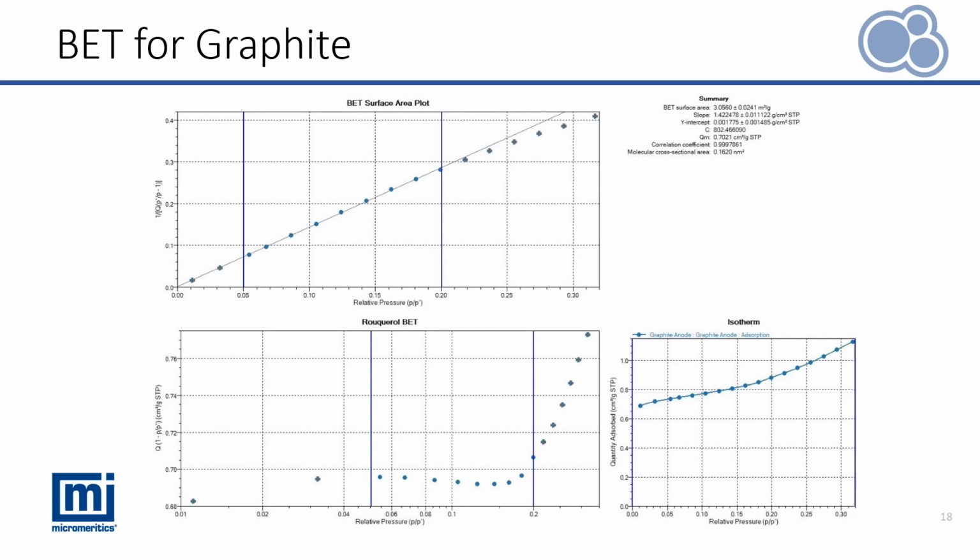So how do these characteristics apply to choosing the best BET range for graphite? We want to select the pressure range after the commensurate transition and select the first linear region in the typical BET range. The extent of the linear region can vary from sample to sample, so it would be best to report the range of pressure used for BET calculations along with the surface area.